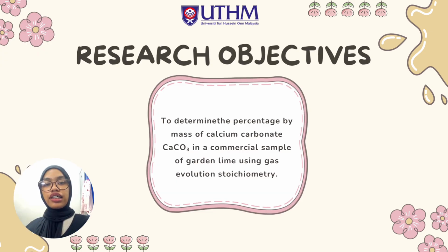For this experiment, the objective is to determine the percentage by mass of calcium carbonate, CaCO3, in a commercial sample of garden lime using gas evolution stoichiometry.